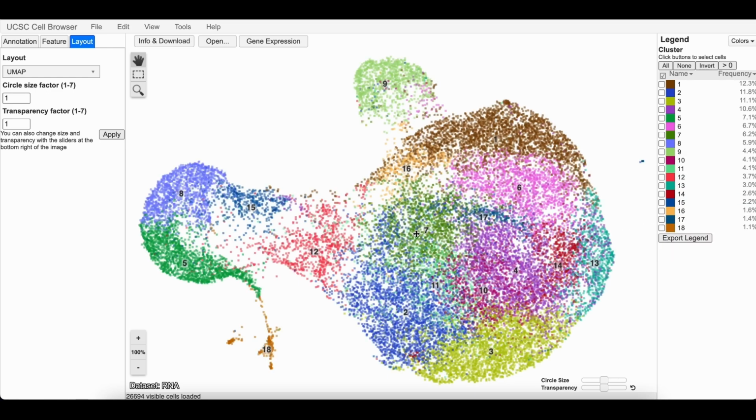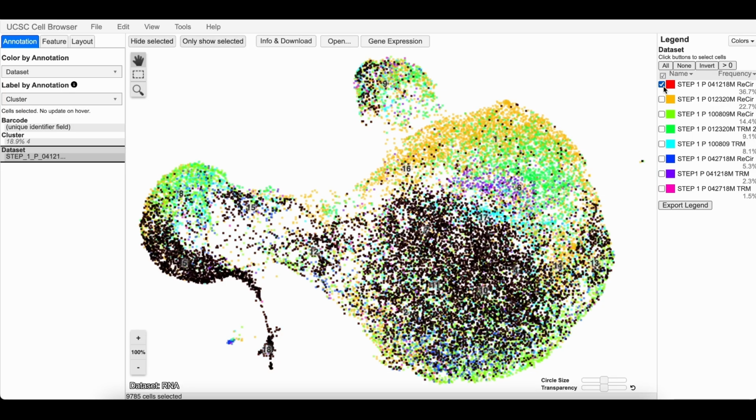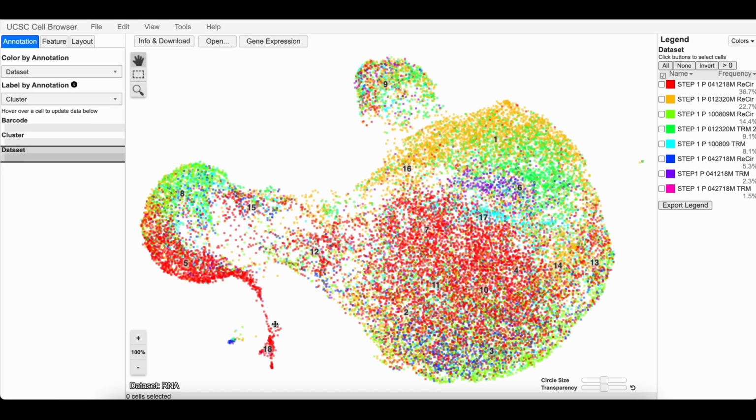And it also shows the differential genes. It shows way more cells. Color by dataset to see every sample colored differently, so you could have an idea to what cluster the sample may belong more. For example, this red sample mostly comes to cluster 5 and is scattered here. It is very useful to see outliers and clusters that might be a result of contamination.